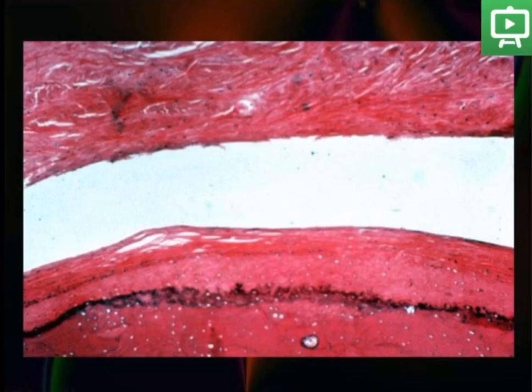In white is the synovial cavity, and beneath is the lower compartment, which is divided into an upper fibrous layer or fibrous covering, also made up of collagen fibers mainly, and fibroblasts and some elastin fibers.